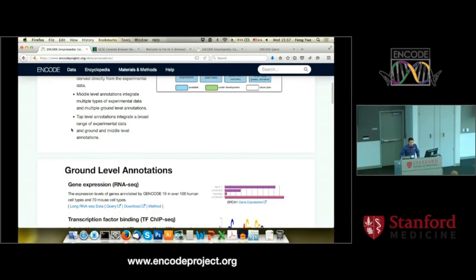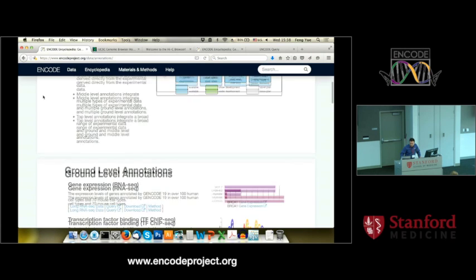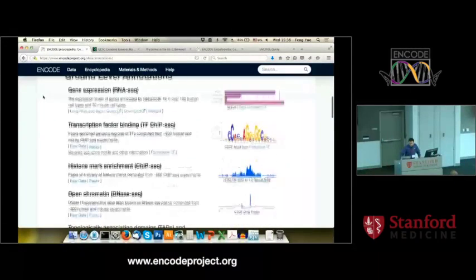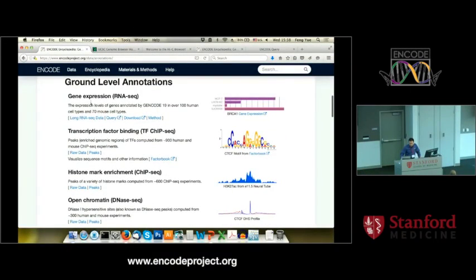I can guarantee you, if you are a student or a postdoc, the most asked question from your PI is: is this gene expressed in this tissue or cell type? Do you really want to download all the datasets from ENCODE to answer that question? Hopefully not, unless you're a big show-off. Go to the middle, ground-level gene expression. There's a link to query.